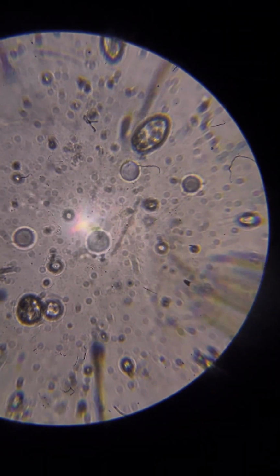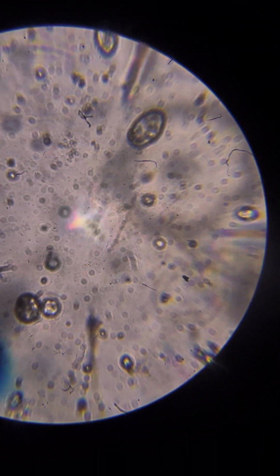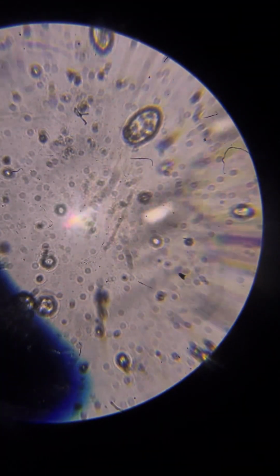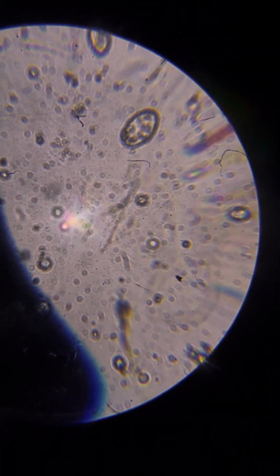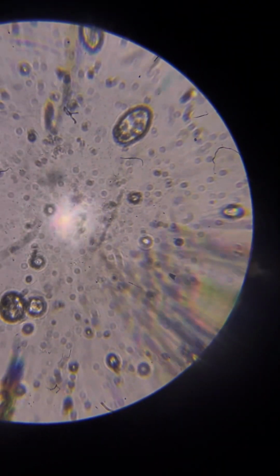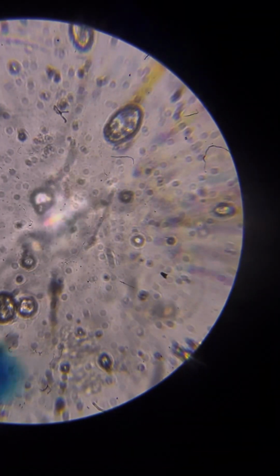You see some flow, which is typical to maximum magnification, especially when I touch the glass. This lens objective sometimes touches the glass, and so it creates flows. I cannot focus very well. I need to calibrate, but it's really awkward. I'll not do it now. But we do see all sorts of neurons in all sizes, which is great.